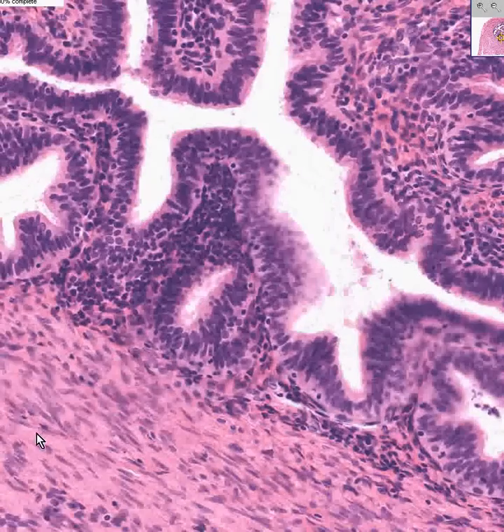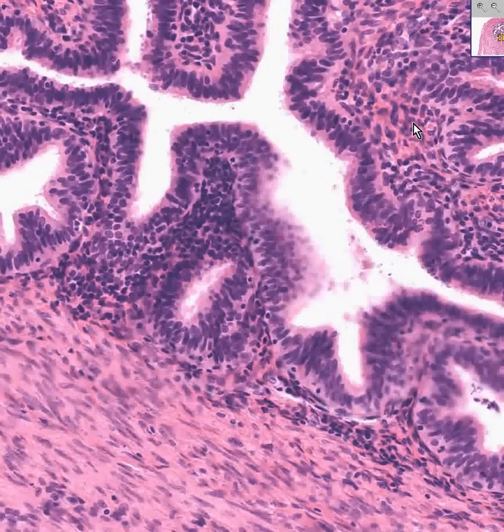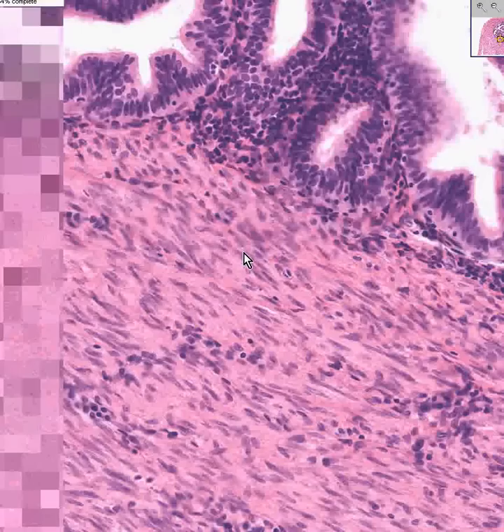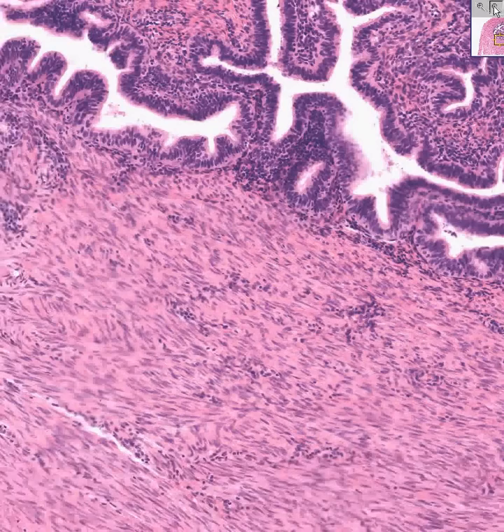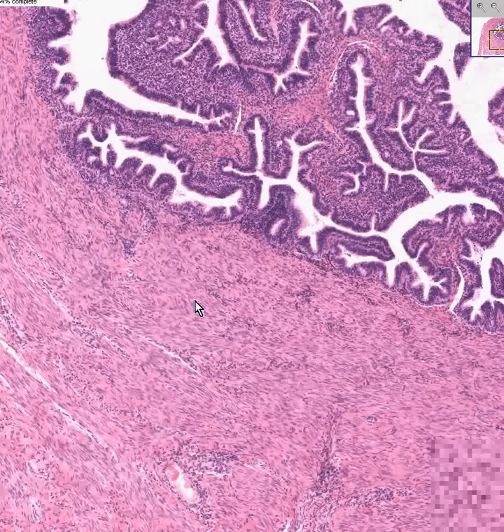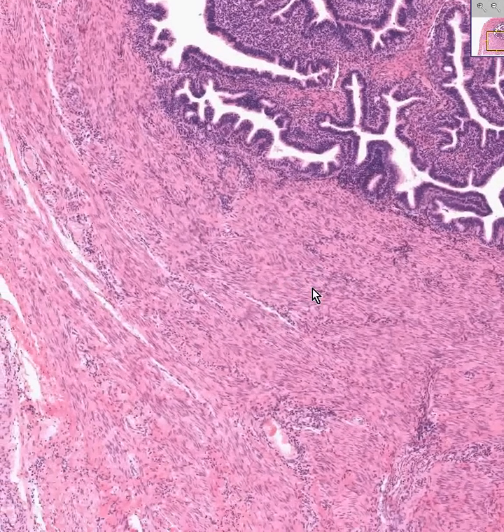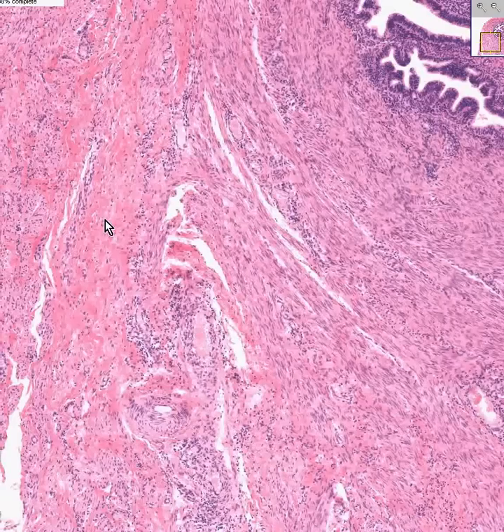Here is some smooth muscle. Here is a little bit redder, perhaps collagenous connective tissue. There is a significant amount of smooth muscle surrounding the fallopian tube no matter what portion you're dealing with, and it looks exactly like smooth muscle anywhere else — as does the collagenous connective tissue which we see here.